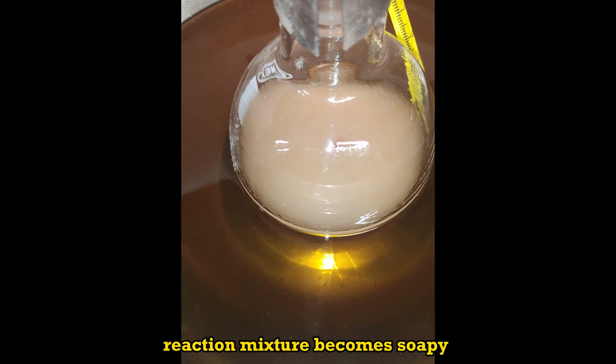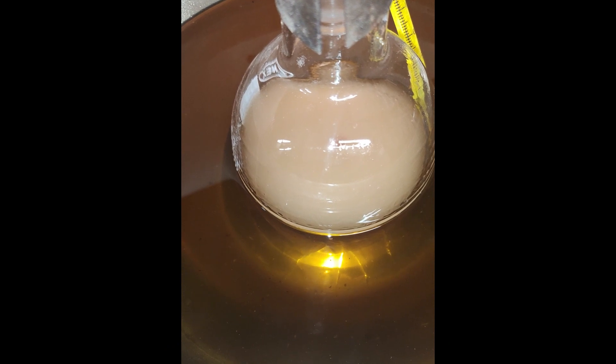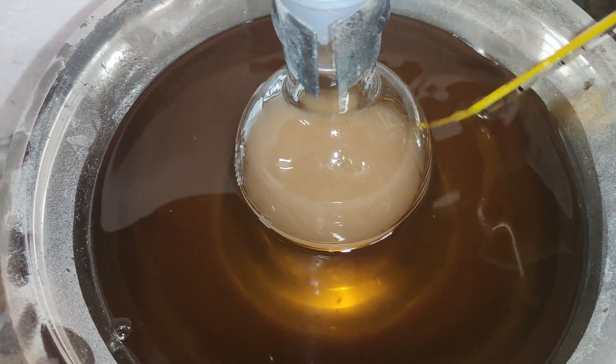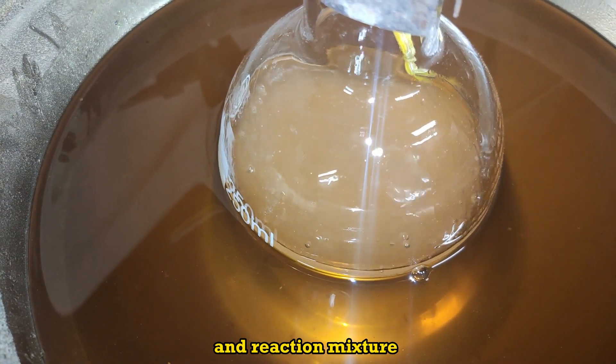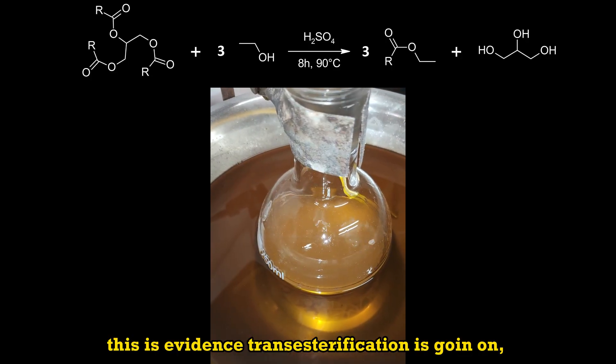With heating, the reaction mixture becomes soapy and single phase. Temperature is maintained around 90 Celsius. The gentle reflux decreases over time and the reaction mixture becomes more limpid. This is evidence that transesterification is going on.